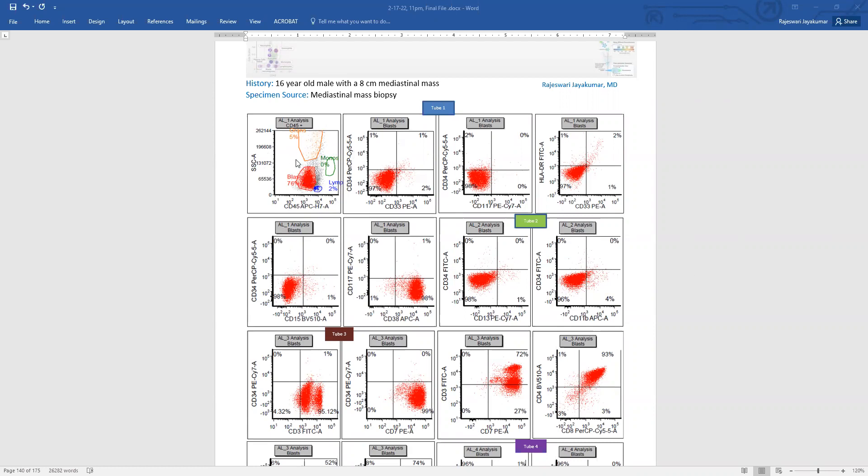There are a few cells in the granulocyte gate, which are defined by a high side scatter and dimmer CD45, then lymphocytes and monocytes. We do have very little lymphocytes here, which have bright CD45 and low side scatter, essentially no monocytes.